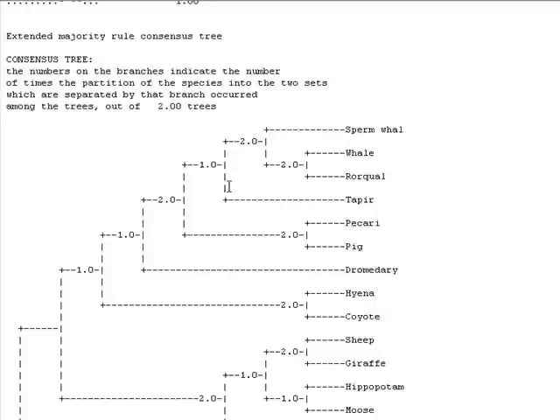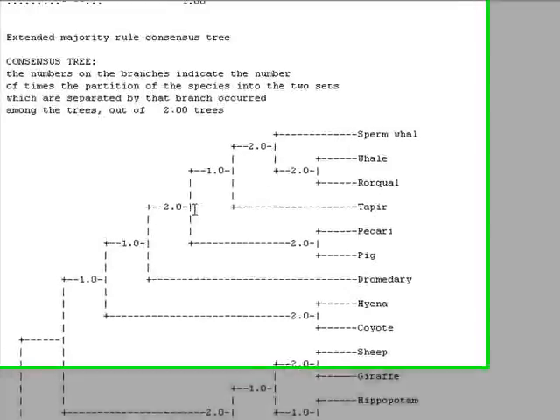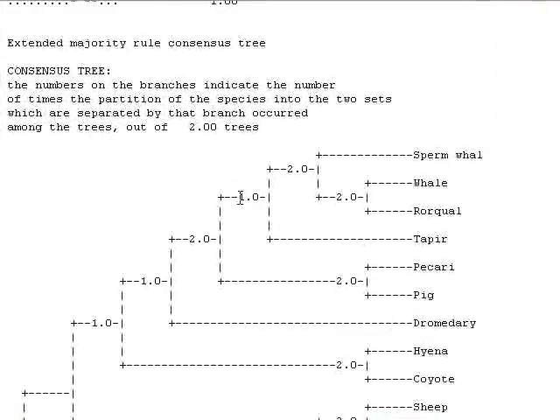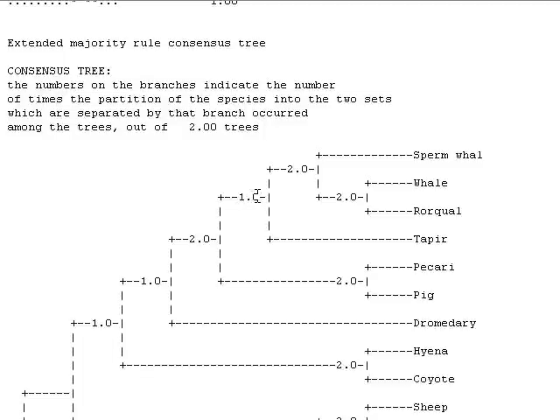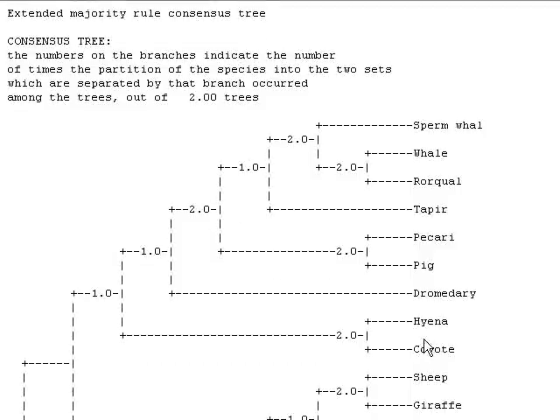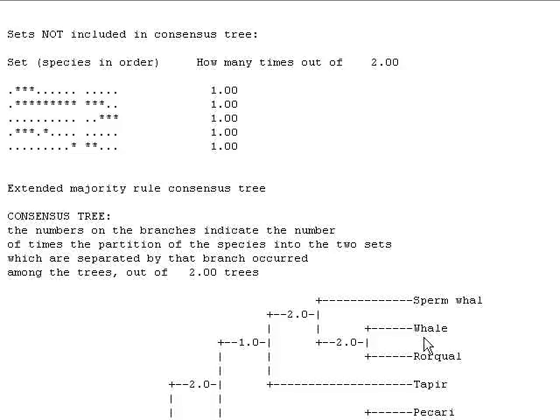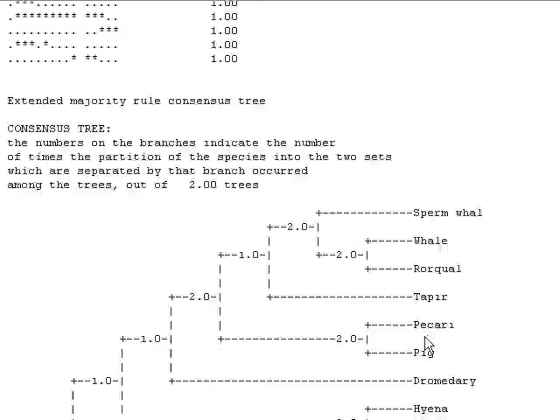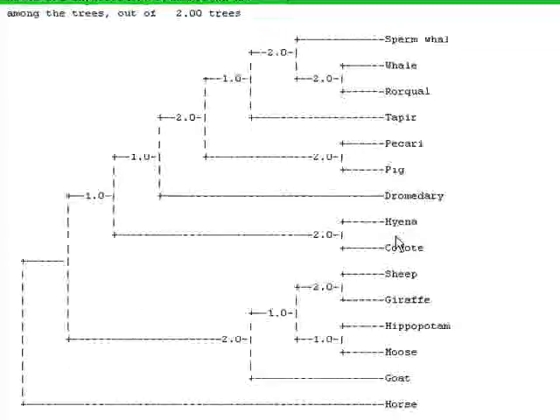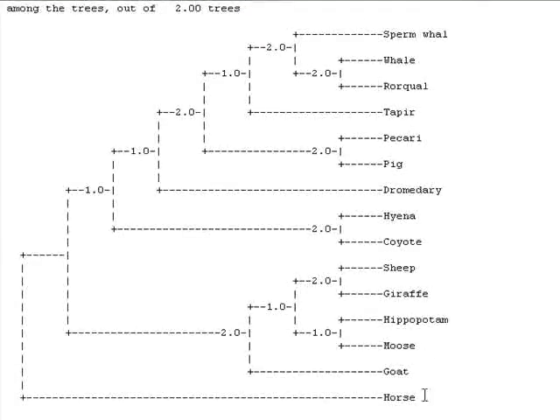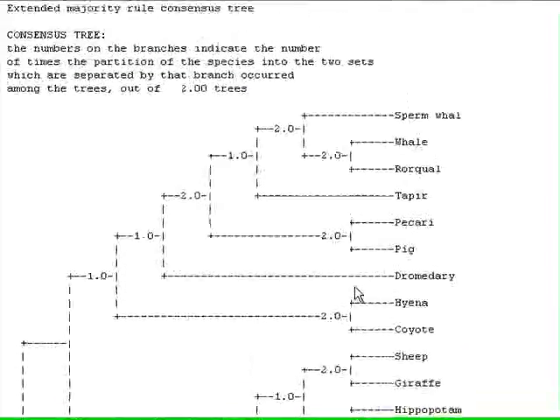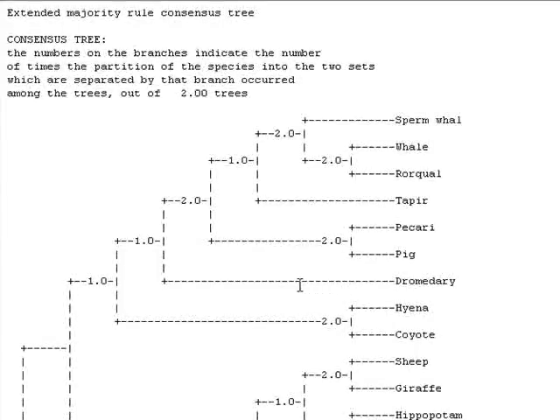And here is our tree. You can see the numbers here. Of course, the higher or bigger the number, the more stable our branches. This is our final phylogenetic tree. So I will give you some advice.